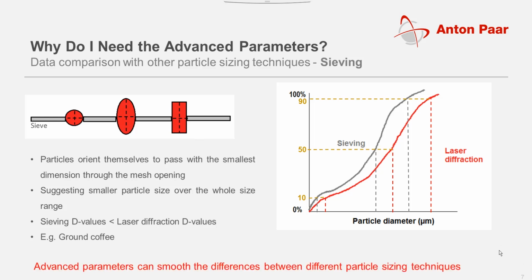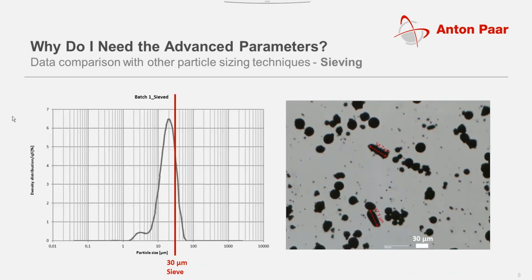However, the advanced parameters allow sometimes to smooth the differences between particle sizing techniques. In this way, users who have been working for many years with old technologies can realize that they get comparable results also with more modern techniques, which are faster, less time-consuming, and more repeatable.